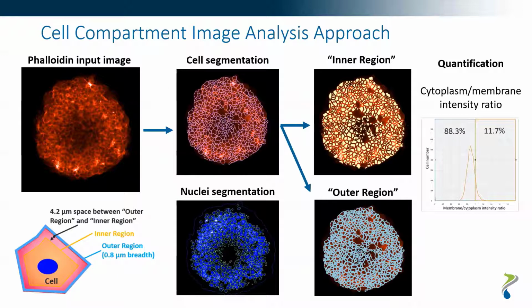Once it's done, we have various graph options to visualize the results. For example, we can quantify membrane to cytoplasm fluorescence intensity ratio. Specific cell populations can also be extracted and classified by getting the feature value data of identified objects. Currently, we're working on optimizing image acquisition and analysis to obtain as accurate segmentation as possible to characterize biomarker expression and cellular localization under various conditions.